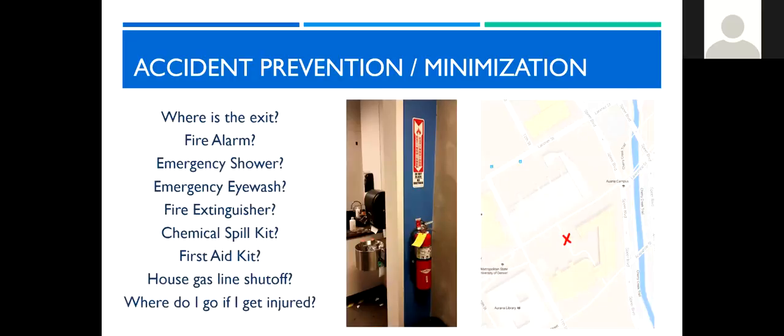Although we try to prevent accidents and injuries from happening, sometimes they will happen. If you respond calmly and quickly following the procedures we were about to outline, you can minimize damage to the lab and prevent any more injury from happening. Let's point out some things in the room. First, where is the exit? Is there a secondary exit in case the first exit is blocked?